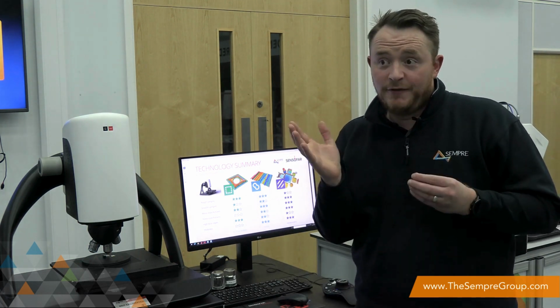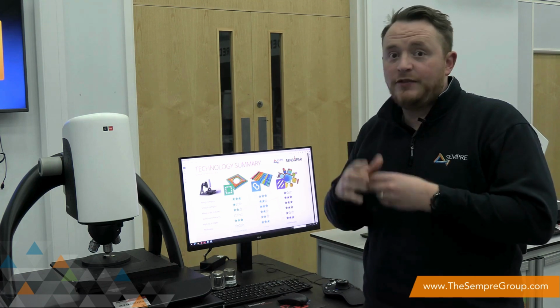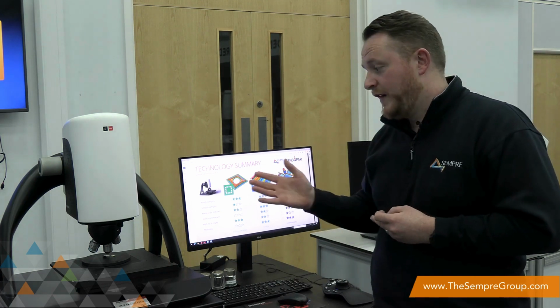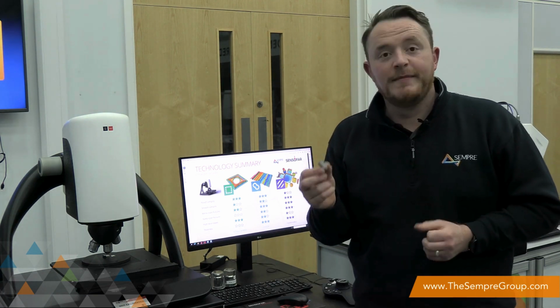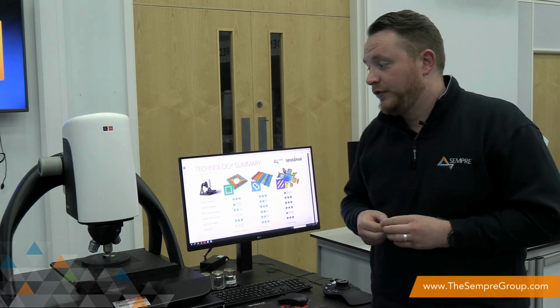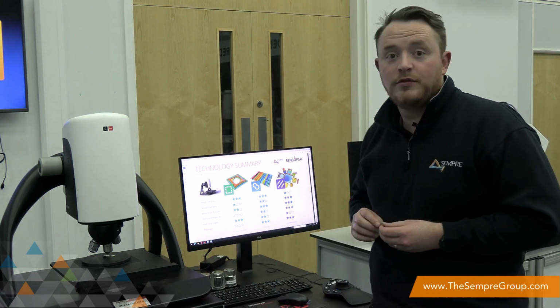So you'll be able to see the differences and the additional data that we can measure on focus variation compared to confocal. And then we're going to place another sample onto the machine and run you through the process of measuring an additive surface, because you can really obtain a lot of data on this kind of surface using the focus variation tool.